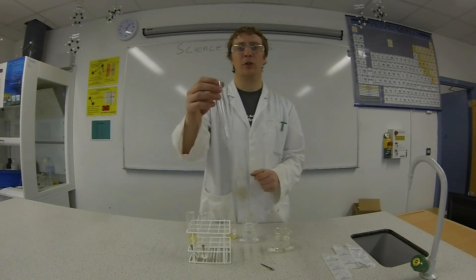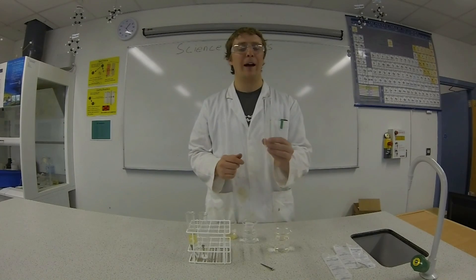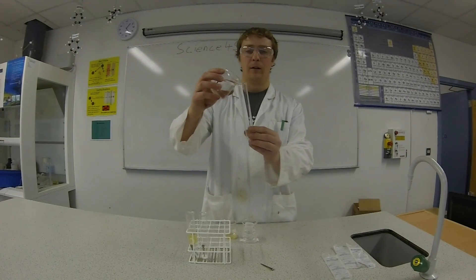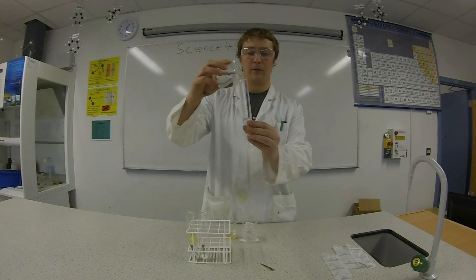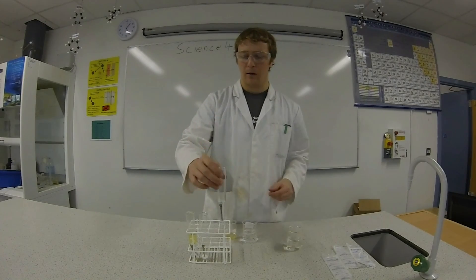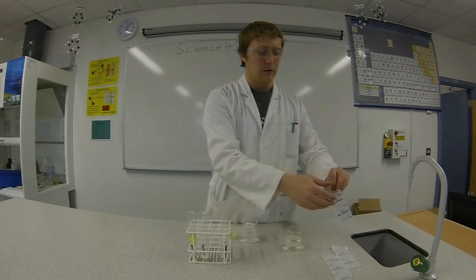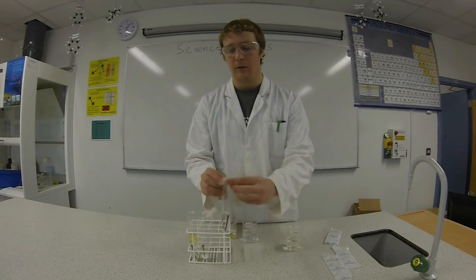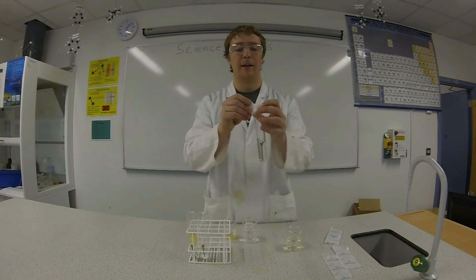And in the last test tube, we're going to have water and oxygen. So I'm going to use this regular tap water, which has oxygen in it, and pop in the nail. And then just to finish off, I'm going to seal each test tube so nothing else can get in.